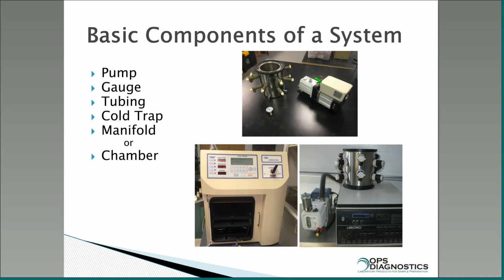You can see a pump, all right, and then you need a cold trap, which is what this center area right there is. And then you need to be able to hook your samples up, which are usually in glass tubes or something, on these ports. That's a vacuum gauge, a nice thing to have in a freeze dryer system as well. So the simplest freeze dryer would be what you see right here.